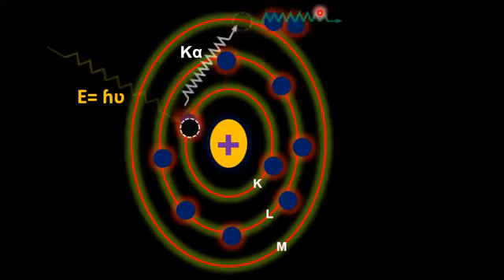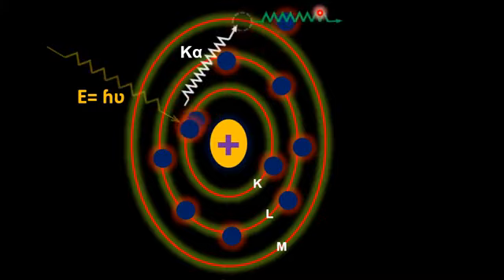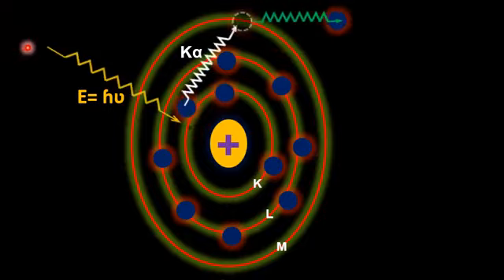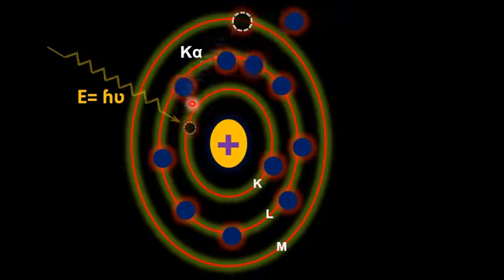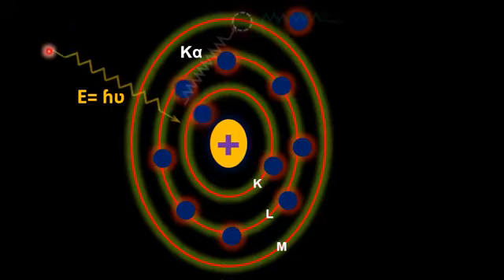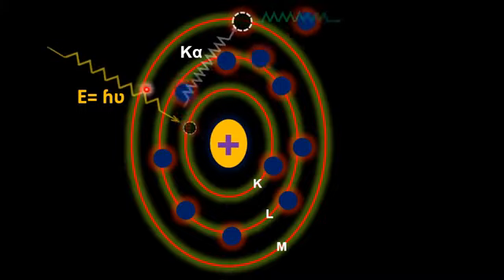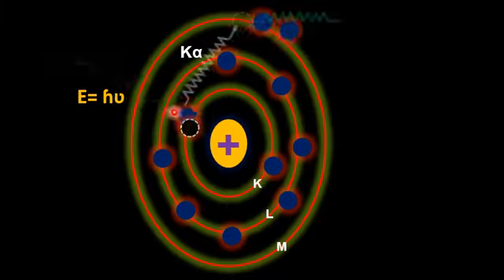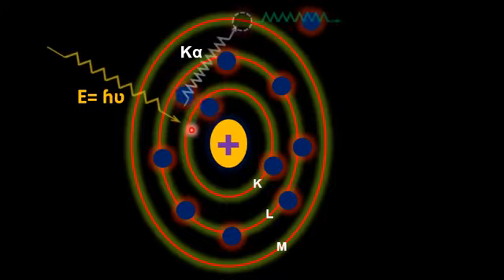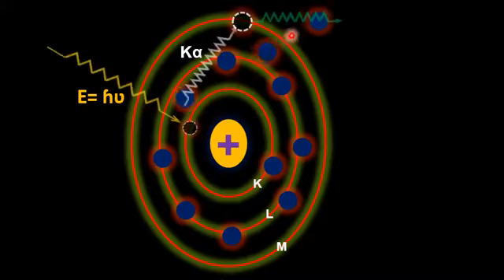So if I simply conclude how an Auger electron is produced in Auger electron spectroscopy: usually a beam of electrons is incident on an atom. When the beam of incident electrons is incident on a core shell electron, if the incident energy of the beam of electrons is higher than the binding energy of the core electron, then the core electron will be ejected, emitted from the atom.